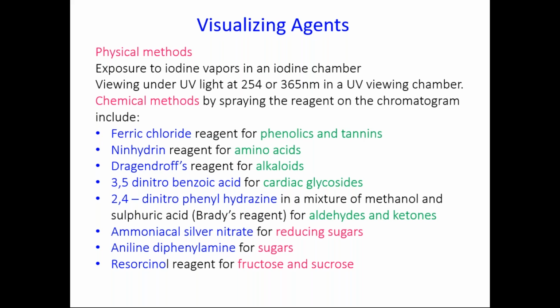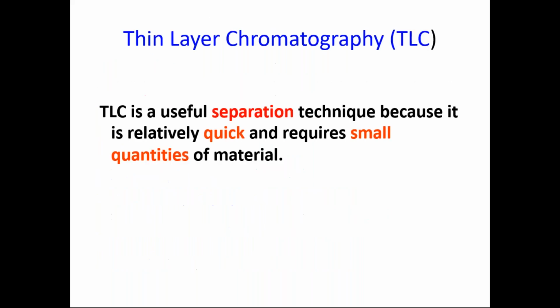But one precaution that must be taken over here is that the spray should not destroy the paper. I mean, it should not eat up the paper. It should be inert to the paper.